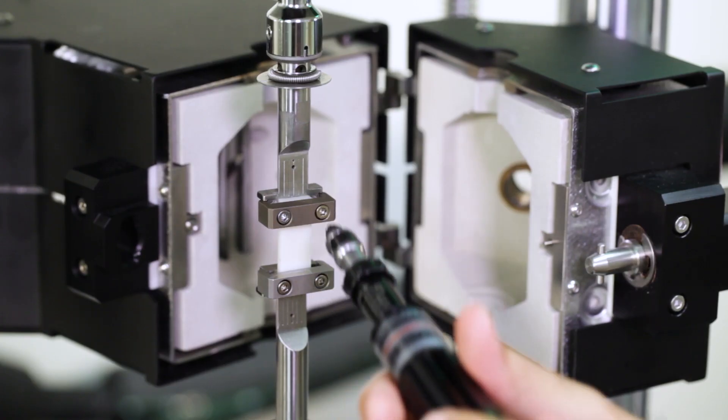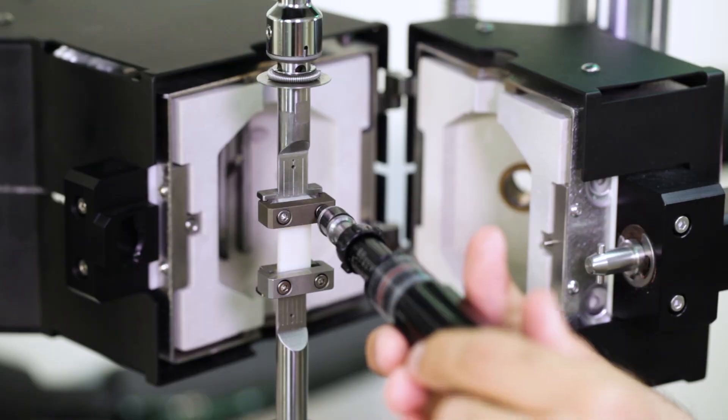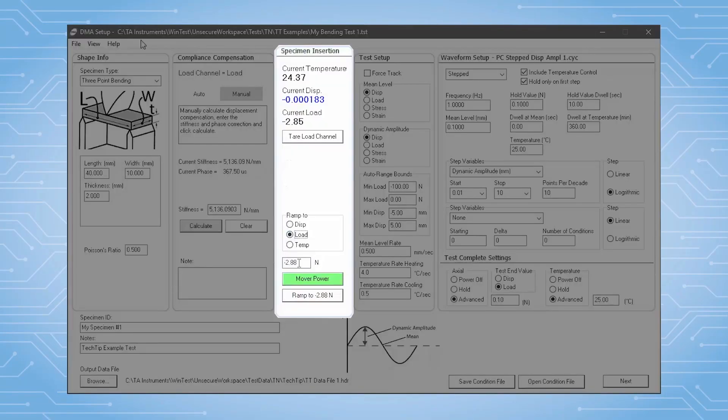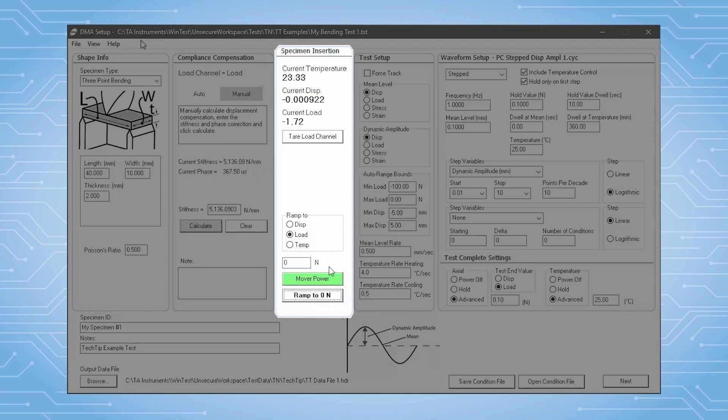And then once the specimen is clamped, we often switch to hold a specific force. This is helpful to avoid any significant changes in specimen force while we change the temperature to the starting temp.